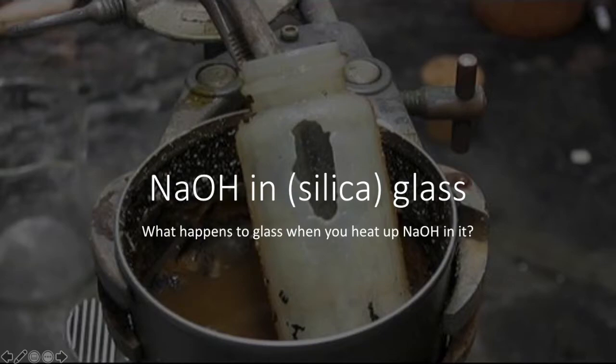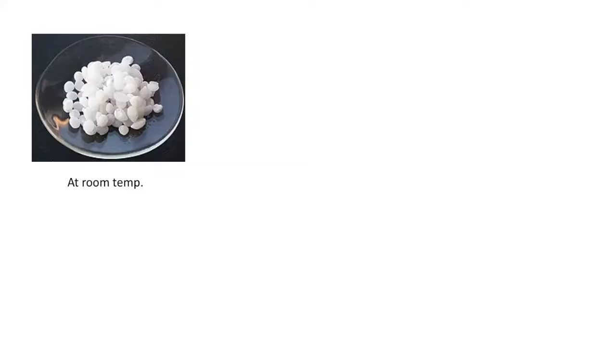This presentation is about what happens to glass when you mix it with sodium hydroxide and heat it up. Sodium hydroxide, also known as caustic soda or lye, is a metallic base that at room temperature is a white crystalline odorless hygroscopic solid.